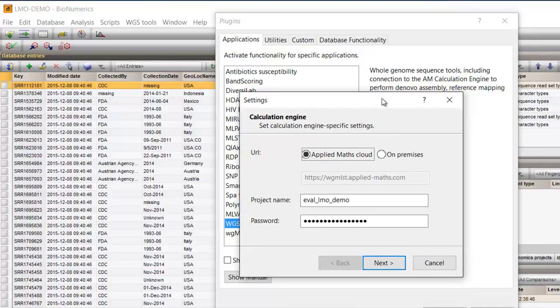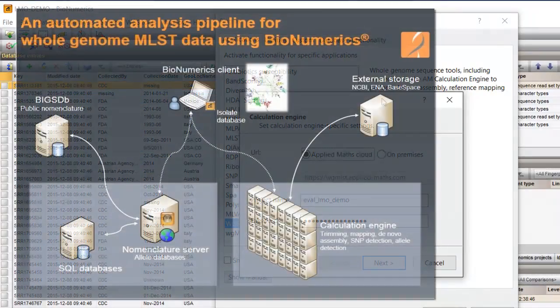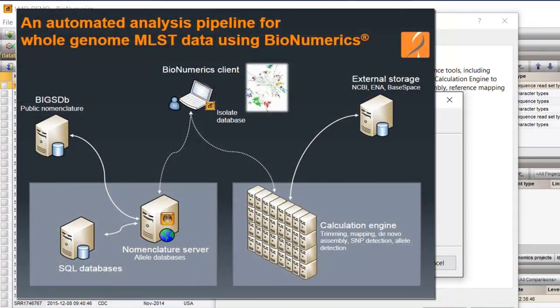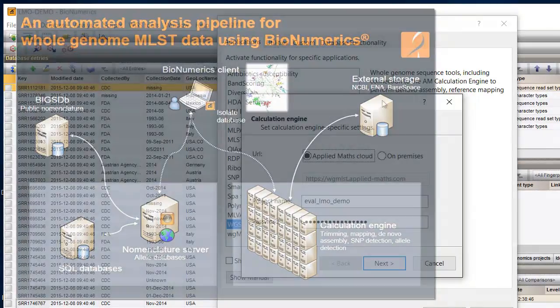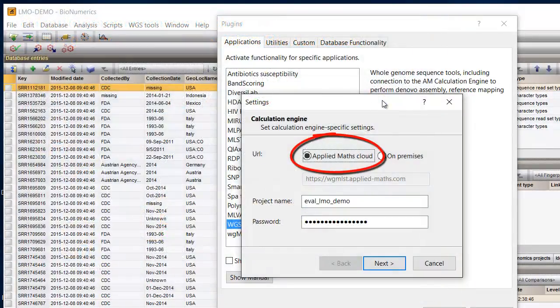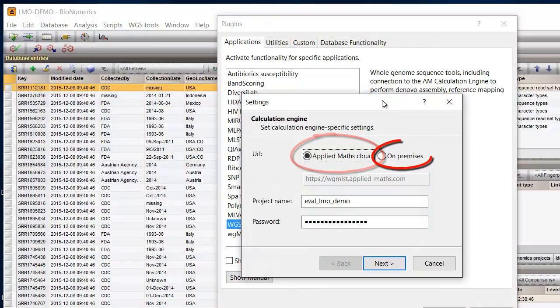This dialog prompts for settings concerning the calculation engine. Demanding calculations such as de novo assemblies can be performed on an external calculation engine. The user can choose between a virtually setup-free pay-per-use cloud solution or a local deployment.